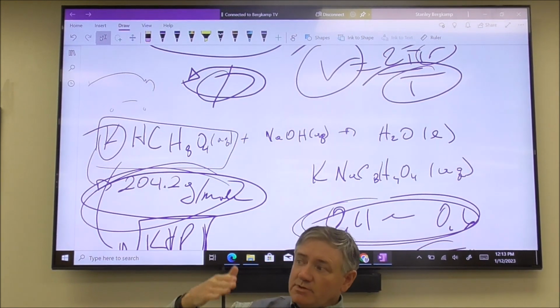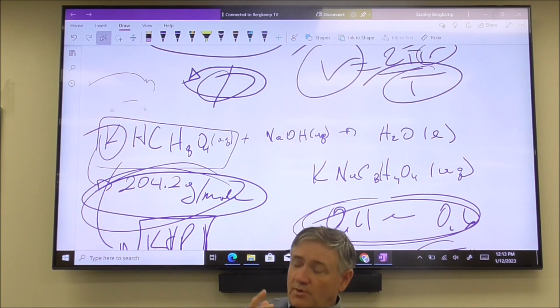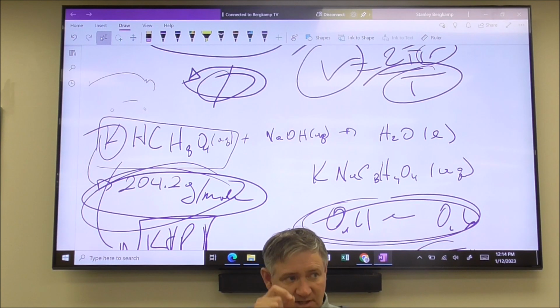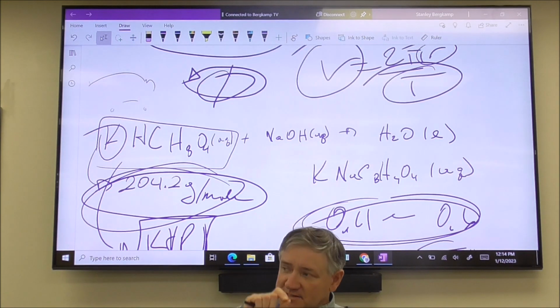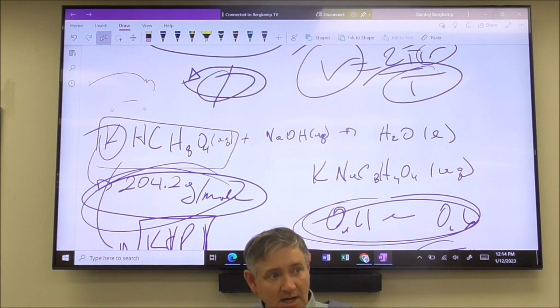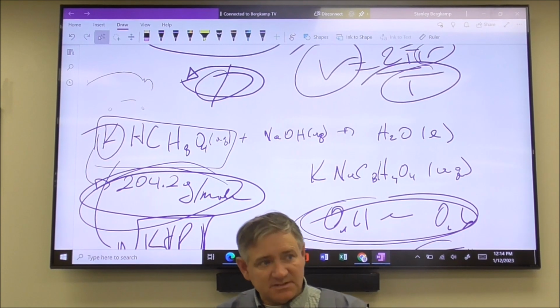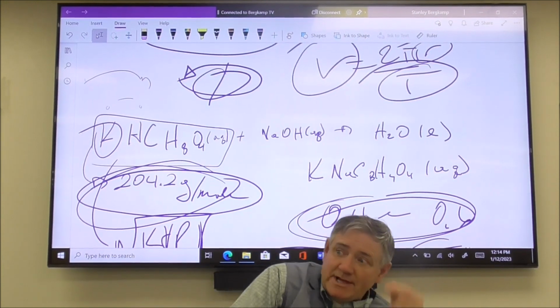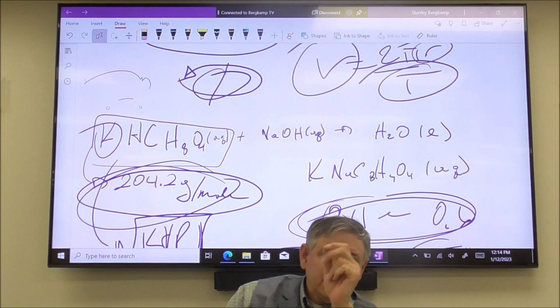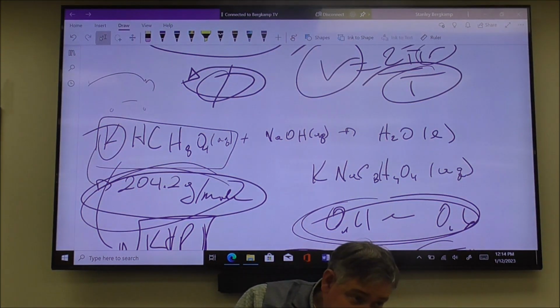So when you get done, what we're going to look for is when your beaker stays a magenta color. That indicates to you that all the KHP has been used up and now the solution goes basic. As long as there's KHP to react, the solution remains clear. As soon as you add that last drop, it's going to look like Peyton's pencil bag.